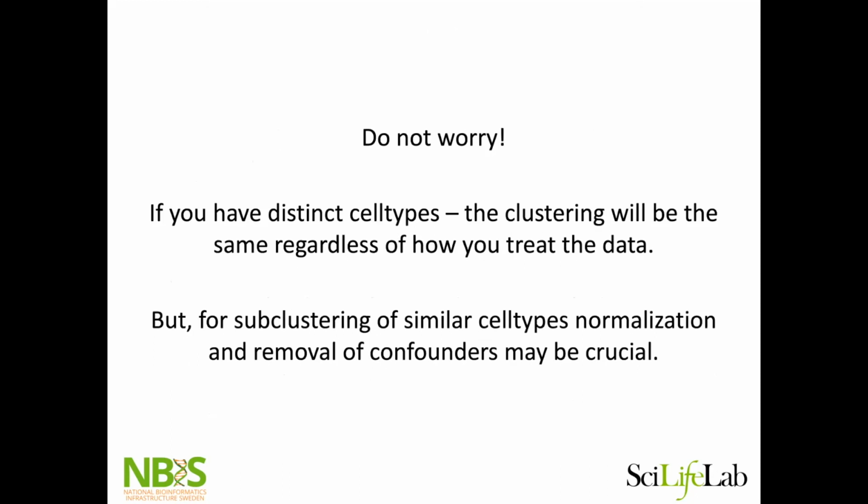And finally, there's so much you can do, but start simple. Start with just normal count normalization, do some dimensionality reduction and clustering, look at what you have. It might not always be the case that you need to tweak every little parameter and scale everything. It's when you see that you run into an issue that you really need to go back and think, how can I re-normalize this to find the signal I want, basically.